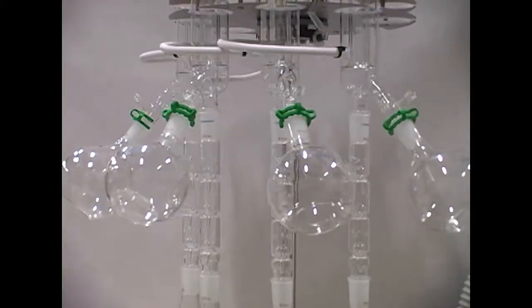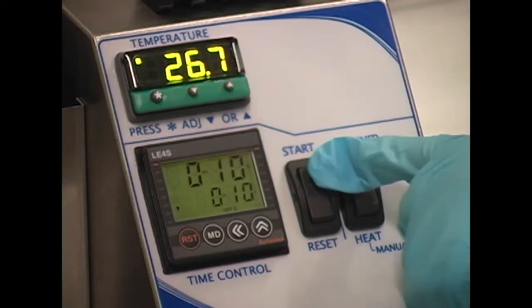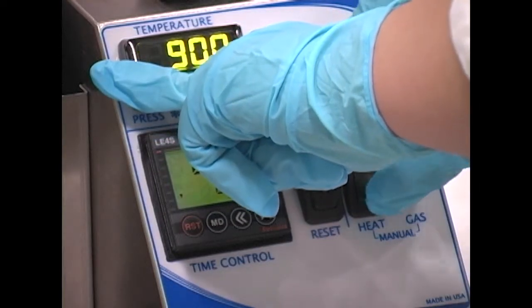The instrument rotates, allowing easy access to all samples. Set the heat system to either manual or timed operation. It is recommended that the system be at operating temperature when samples are loaded.